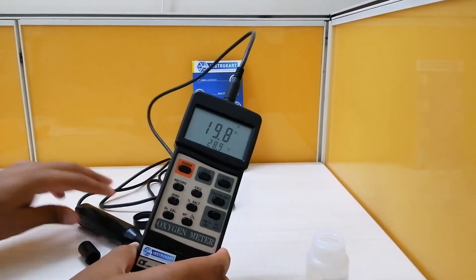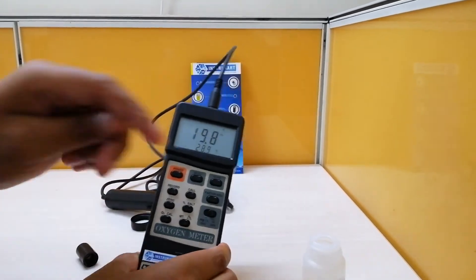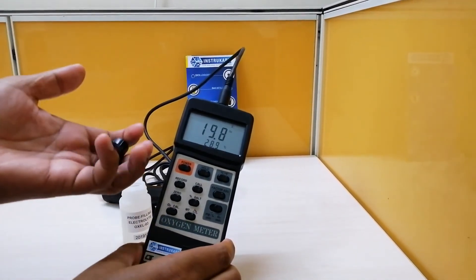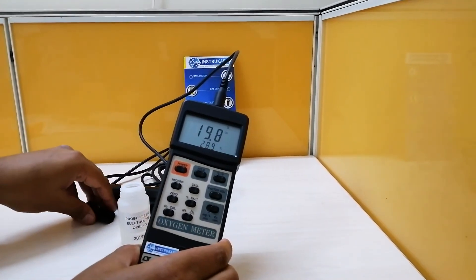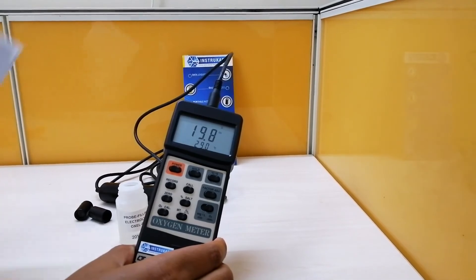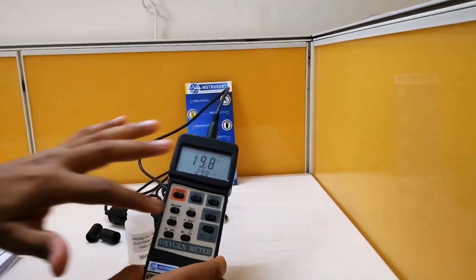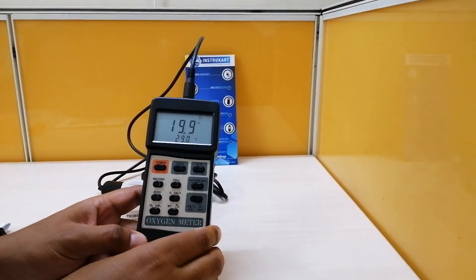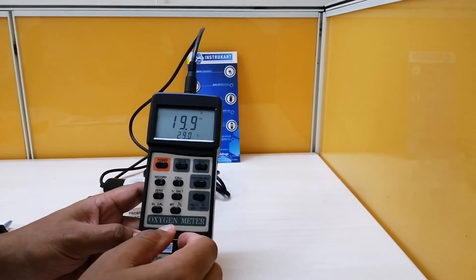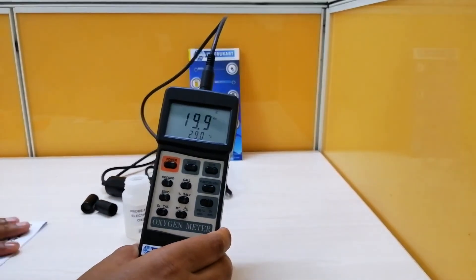The standard accessories included with this instrument are the probe, a bottle of electrolyte, and two spare caps. You also get an instruction manual which explains all the buttons and their functions. The instrument has different button types for various adjustments and functionalities, all explained in the manual.